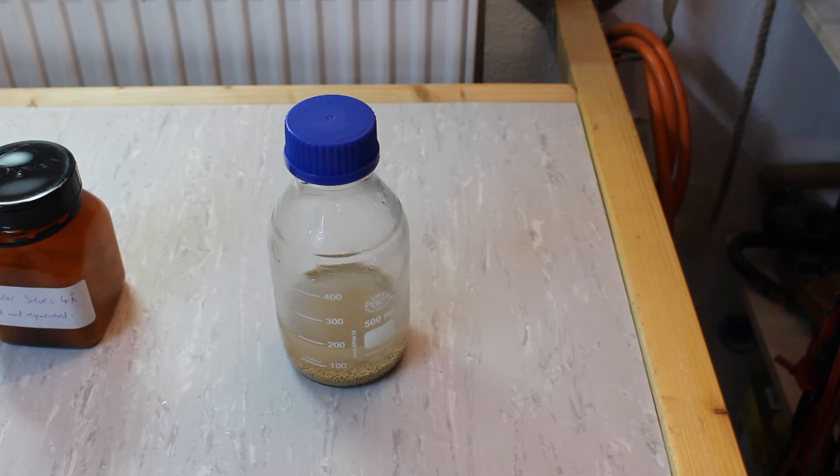We're pretty much done here and all we have to do is let the ether sit on top of the molecular sieves for a while, and then I'll probably transfer it into another bottle onto some new sieves.